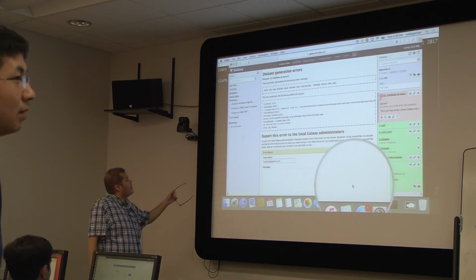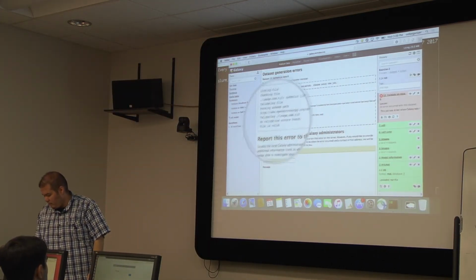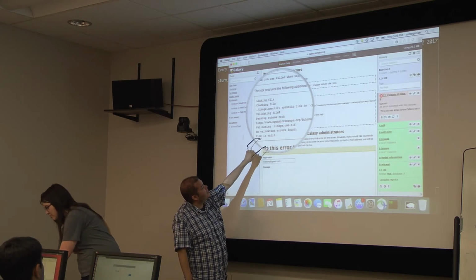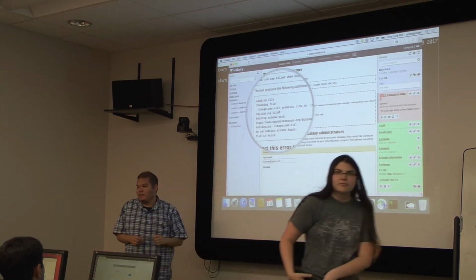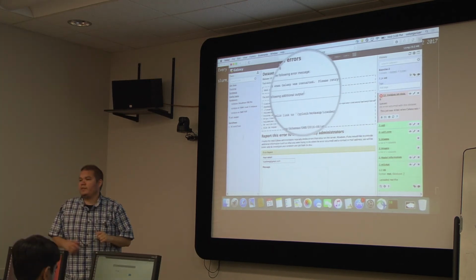So in this case, look at this. It's actually telling me that it validated the file. See? It's telling me that the file got uploaded and sent to the system compared to the Open Microscopy schema, and it's telling me that the file is valid. But for some reason, did you see the error on top? So Galaxy was restarted.